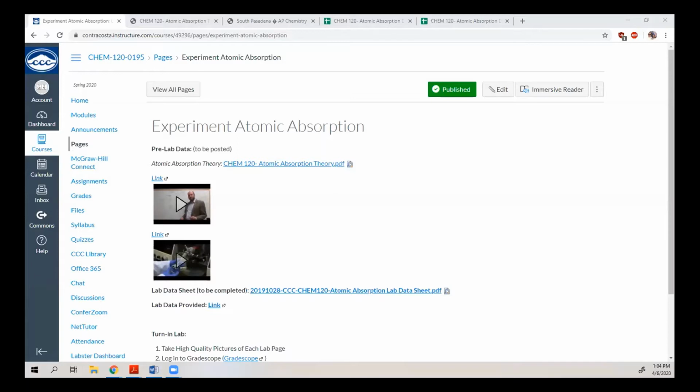And while I've been able to find some videos that showcase it, I didn't find a great simulation that I really liked. And so we're going to do a combination of me providing you with data, and then there are also some links to the instrumentation so you can see what that looks like. On our module page, this video is what's posted here, so we should be starting with that. What I want you to do is go ahead and open up this document here, Atomic Absorption Theory, as well as this data sheet.